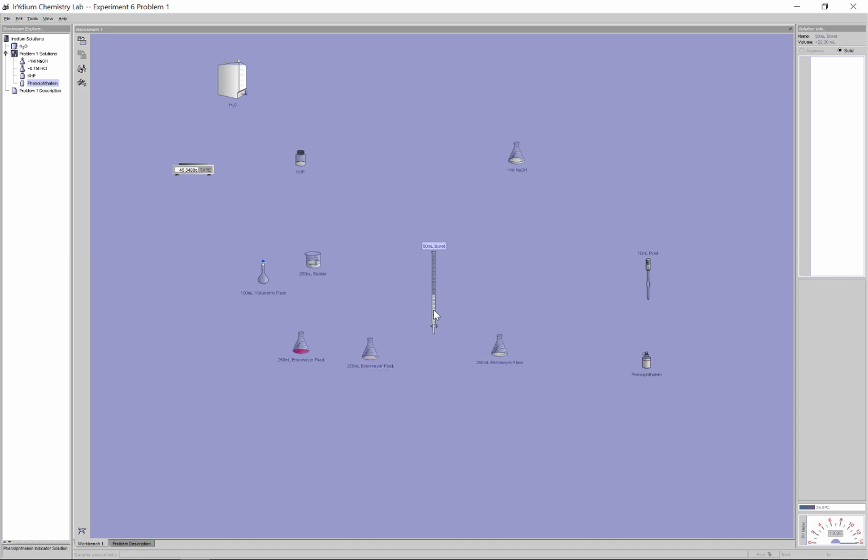I want to take a burette reading. My burette here is currently at the marking 28.92 maybe. So 28.92. I'm noting down these volumes here on the side, so I'm going to show you these calculations afterwards. I still have a good amount inside, so I don't need to reload the burette. So let's just take this 28.92, which is now going to be the starting volume for my last titration.